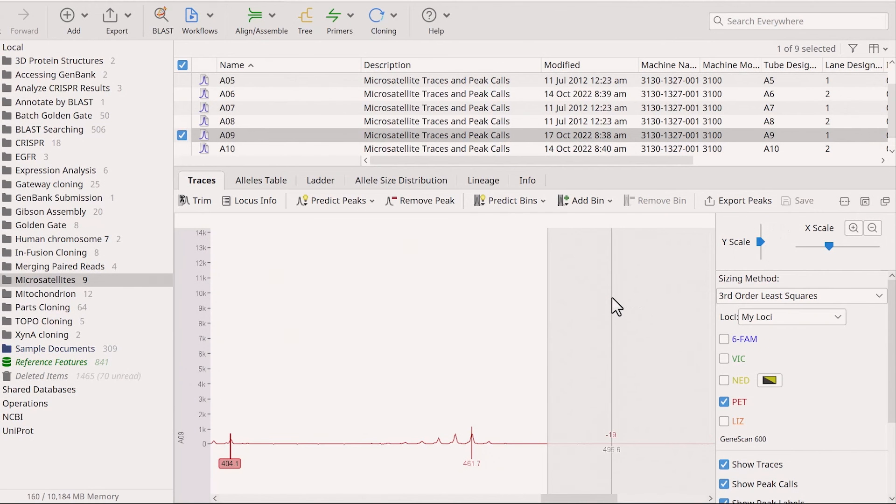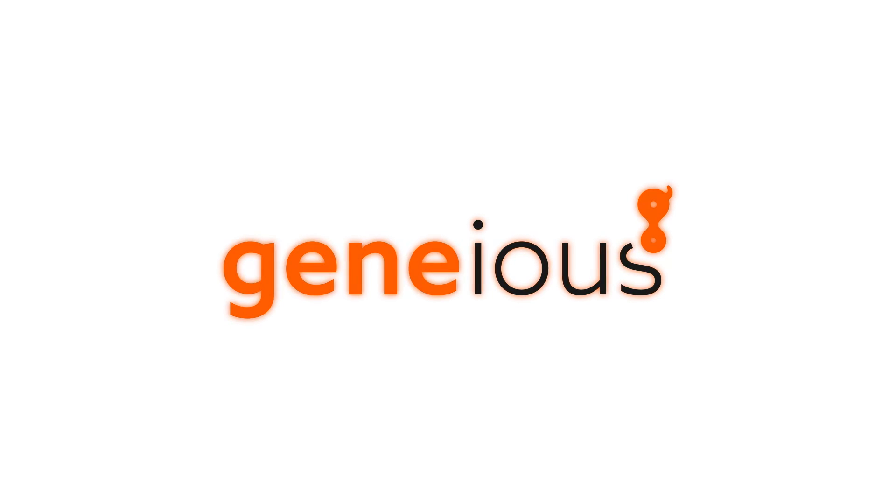You're now ready to perform the binning. To learn more, visit Geneious.com.